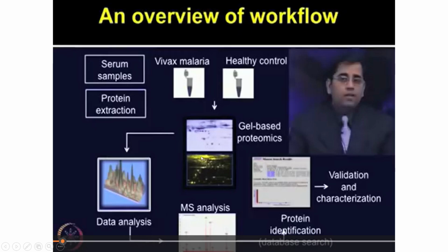We just discussed this initial part of it, and we will go through each and every specific detail about it, as well as a bit of the data analysis part. As we said, if you want to identify and characterize the protein, here you are just quantifying that the protein is there and this is the relative amount.